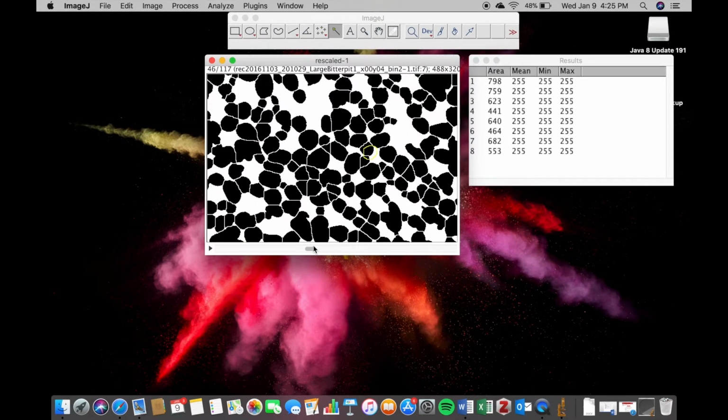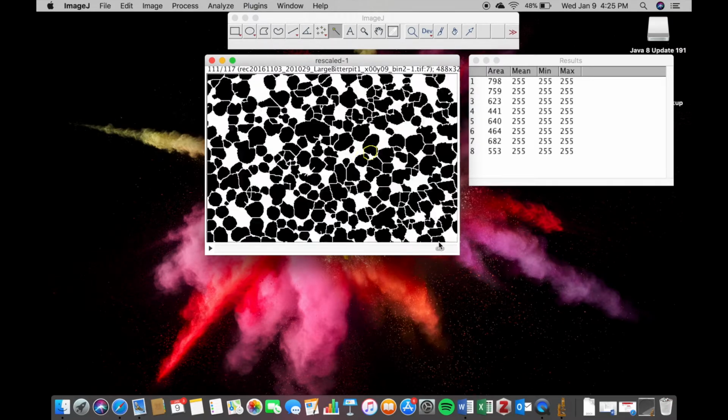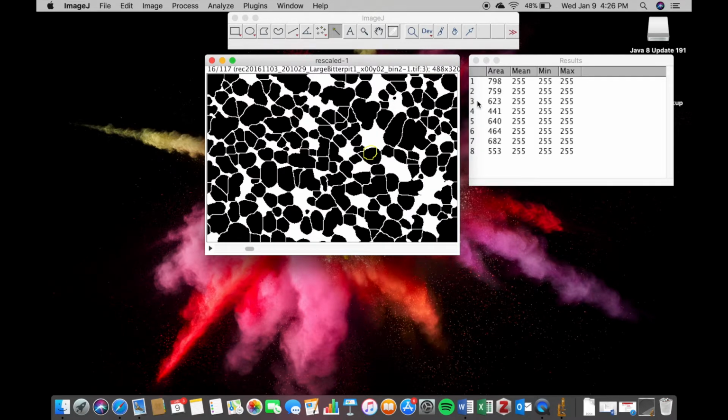Then you do it for the rest of the images until the last one, 117. And this number is the number of the cell area. You need to convert this number to millimeters squared by using a trigonometry formula to get the real size of the cell.